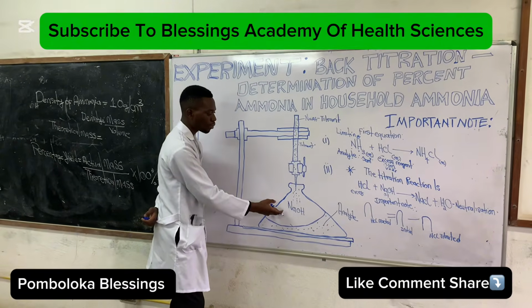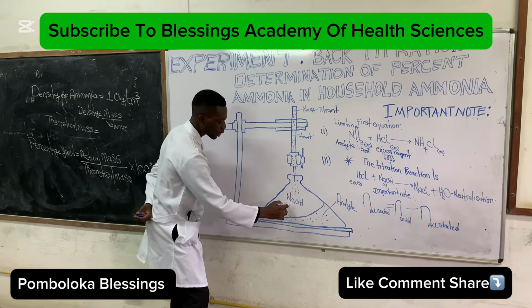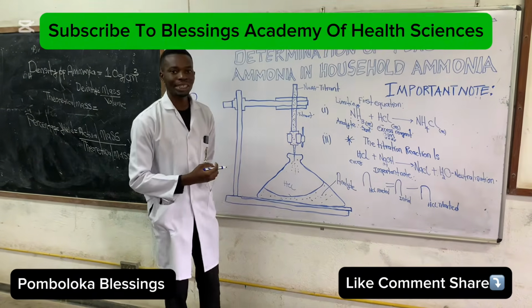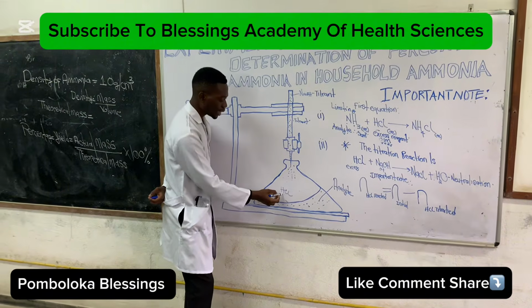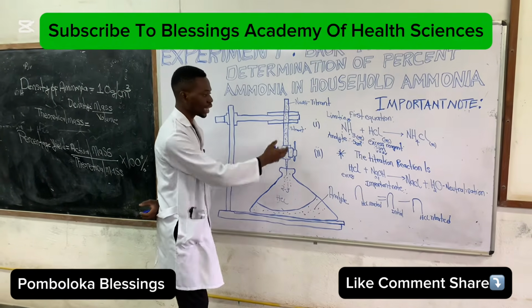What you're going to have in your conical flask is the HCl, which was in excess in the first part of the reaction with the ammonia, because the ammonia completely vanished as it was the limiting reagent. You're going to have HCl, and then you're going to add 2 to 3 drops of the indicator, which is phenolphthalein. And then you are going to titrate.